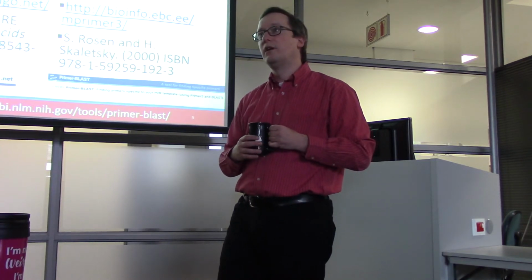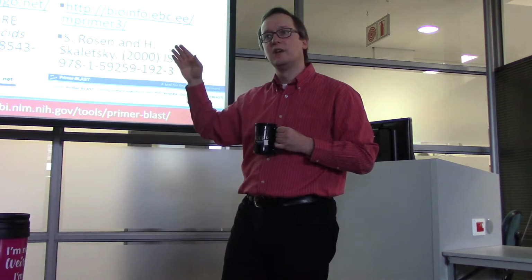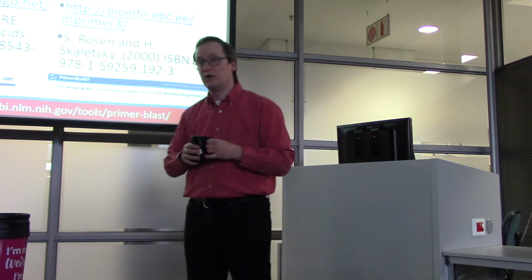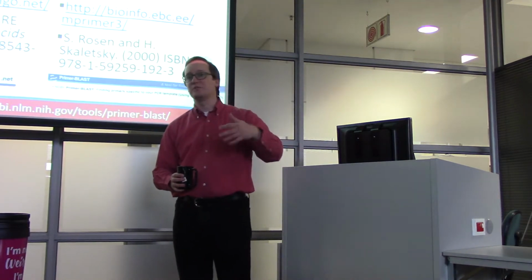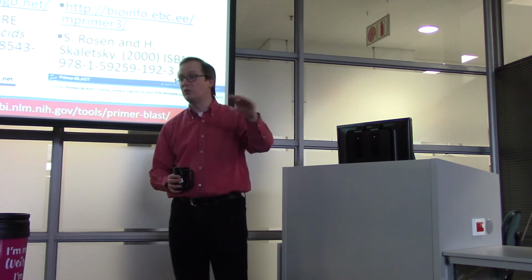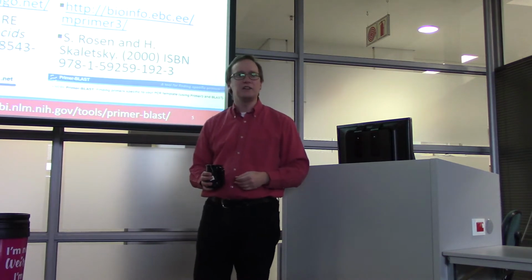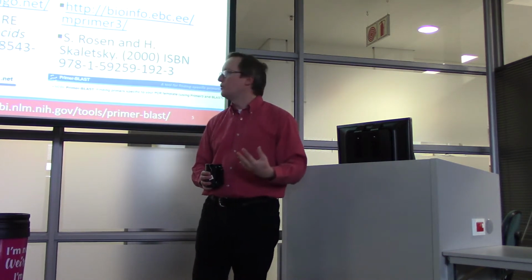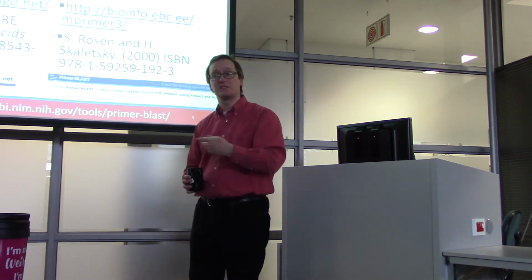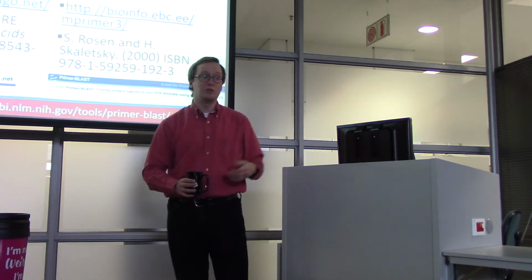I think that this little dichotomy between these two toolkits has a lot to teach us about the practice of bioinformatics in general. Commercial and open source tools may exist for the same purpose. Do we have a fair comparison between the two, an apples to apples comparison, which of these out-designs primers? Maybe not. But we do try to do that in lots of cases where we have competing tools. So as I move through these slides, you're going to see lots of cases where there are lots of tools doing the same thing, and we need to have some way to evaluate them.